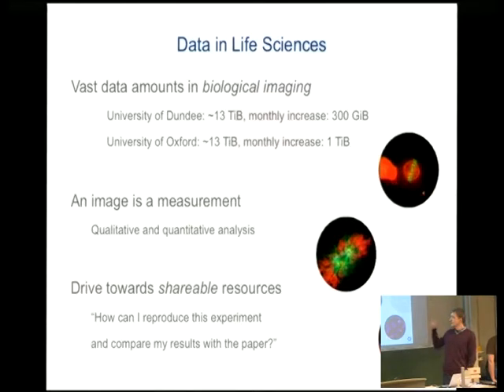Open access to those images drives and facilitates the lack of repetitive experiments, which means that scientists can look at a scientific paper, can validate instantly the results by looking at the raw data that's been bundled together with the paper. Systems like that already exist, and they are driven by open microscopy.